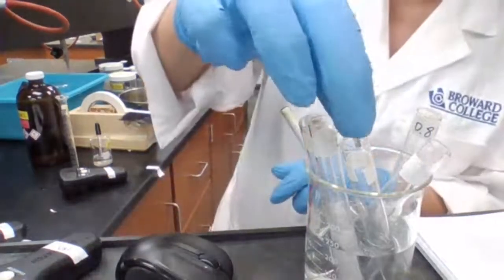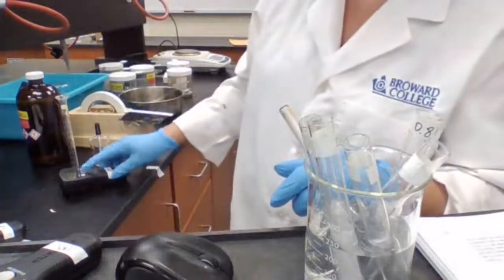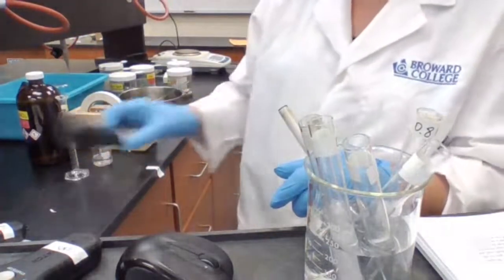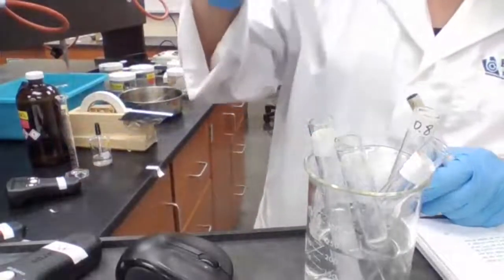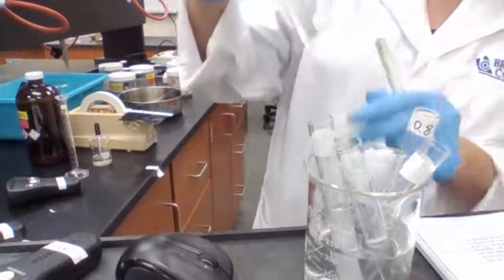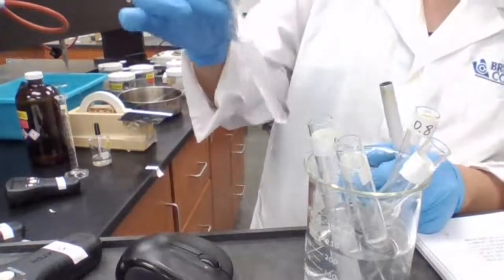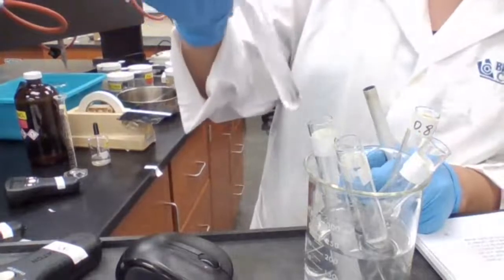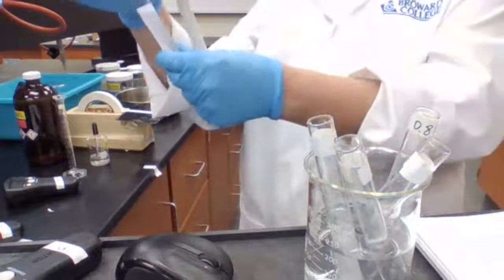Adding a piece to 0.4 and starting the time. Nothing has dissolved yet. I'm expecting the 1 molar to be the fastest and dissolve first, but it has not dissolved completely yet. Almost there though.